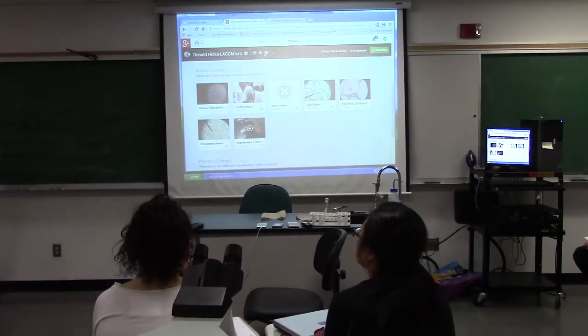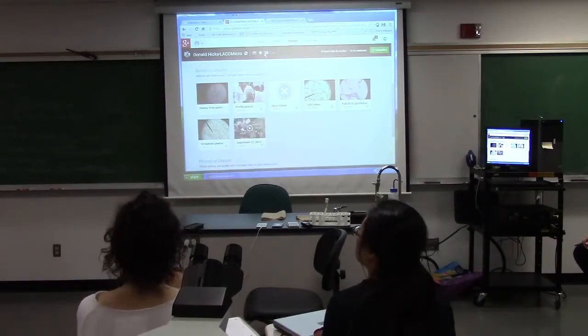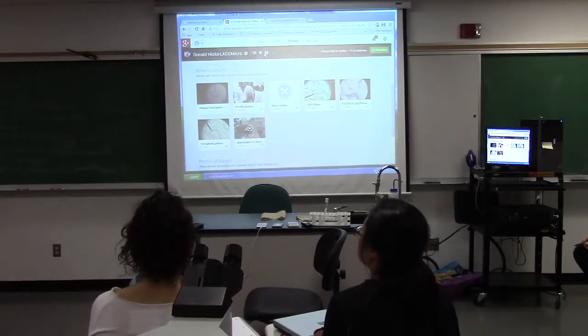All right, so after our big pop quiz tonight, we're going to do lab 4, and we're going to concentrate on endospore staining, and then at the last half hour, you can stain anything you want.